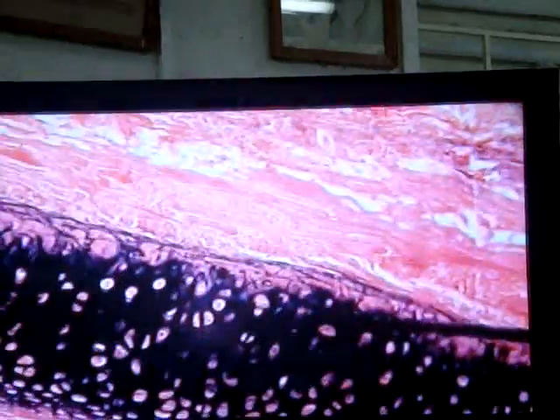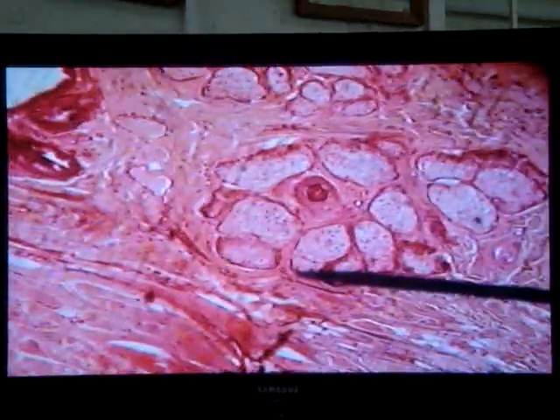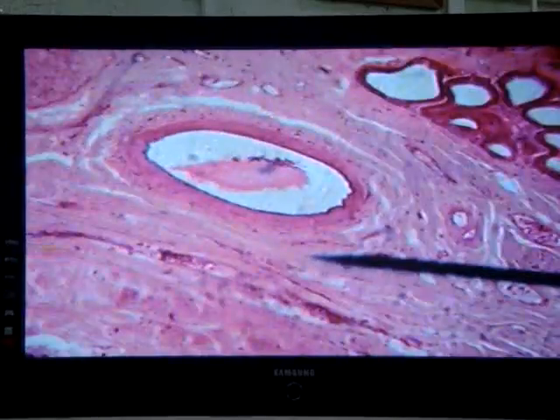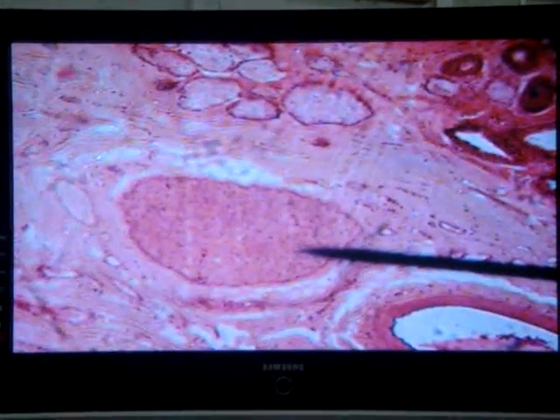Now guys, this happens to be a slide of the pinna. So look, this happens to be pinna. So that's the elastic cartilage there. But all of this represents dense irregular connective tissue of the dermis. And the sebaceous glands are there in abundance. We're seeing some nerves, some blood vessels and so on. Another blood vessel there. It's another beautiful nerve. So all kinds of things are associated with skin.